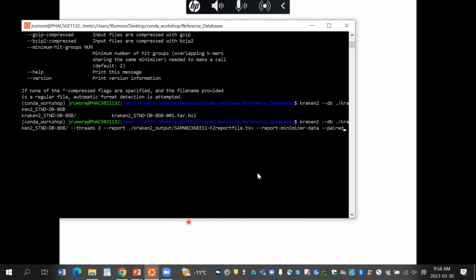And now we're going to point to each of our reads. So our R1 and our R2, which again is located in our data sets downsampled. So in the current directory, so the / dataset, so we can just DA, you can tab complete that. Okay. And then we know it's in downsampled, so we can type the first few letters, tab complete.